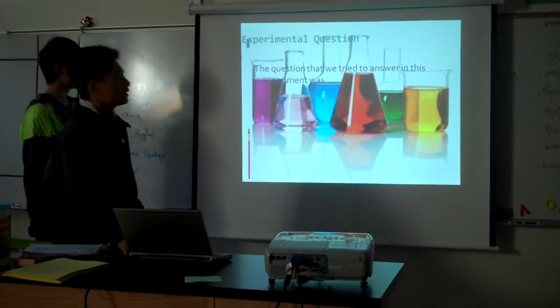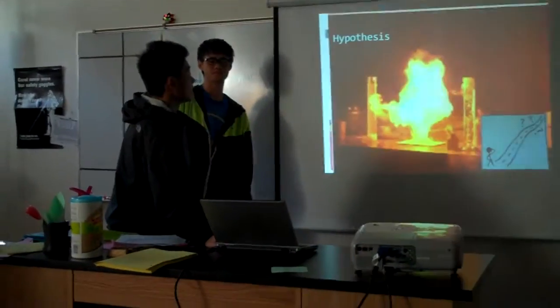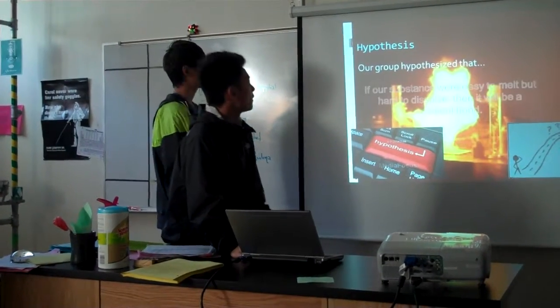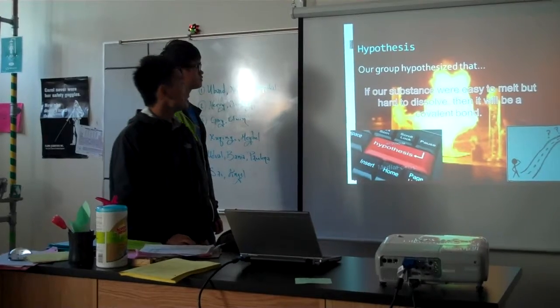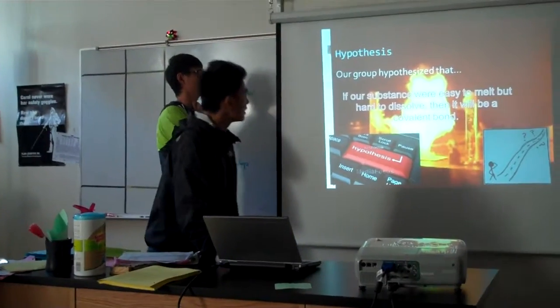So the question that we tried to answer in this experiment was, what is my unknown substance? Based on this question, our group hypothesized that if our substance were easy to melt but hard to dissolve in water, then it would be a covalent bond.